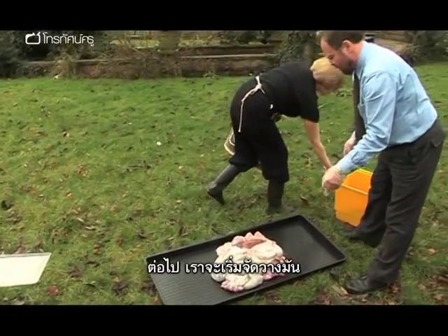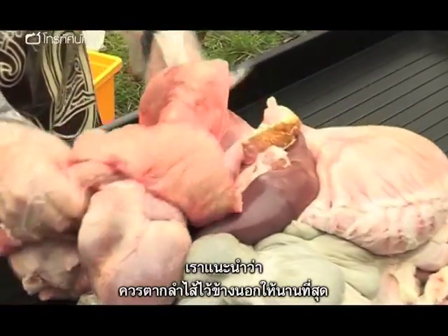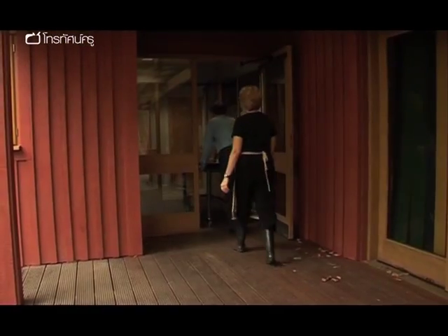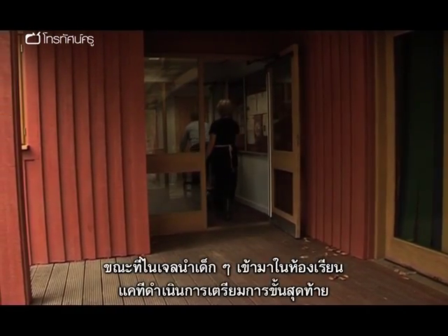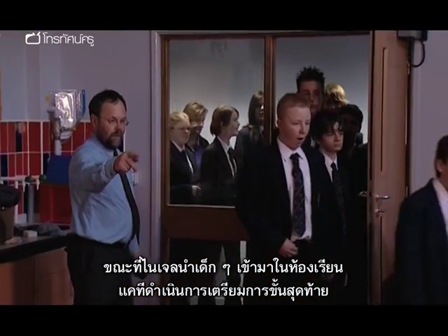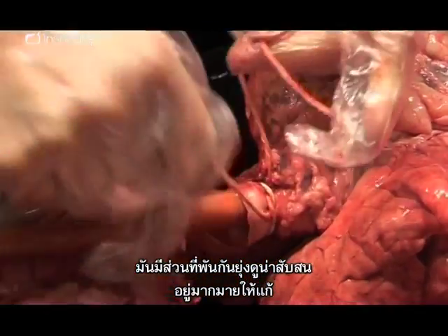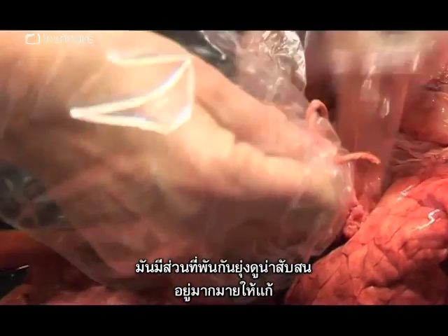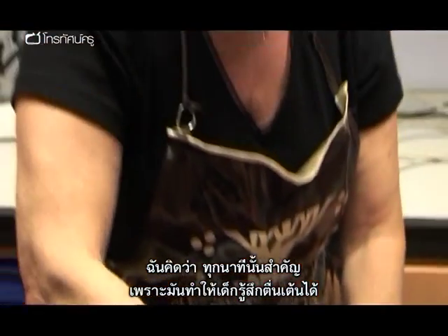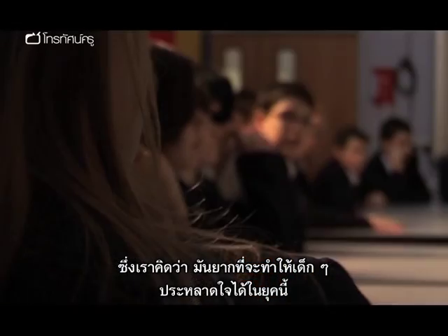The next step is to start laying it out. It's advisable to keep the intestines outside for as long as possible. Whilst Nigel brings the students into the classroom, Cathy carries out the final preparation. There's a lot of mess, heavy lifting, and hassle to this, but every minute of it's worthwhile for the wow factor, which we find so difficult to give kids in science now.